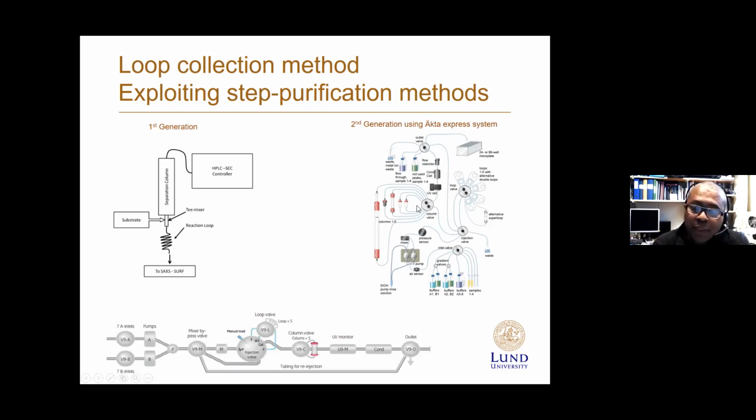And what we do then is just automate and say we would like to inject any of those fractions now with our reaction loop and look at the reactivity. So all of a sudden, we can now automate and do 5 or 10 experiments with the same sample without having further interactions with the instrumentation. And this is how it looks on the ECTA setting up device.